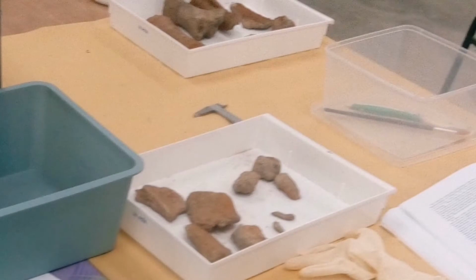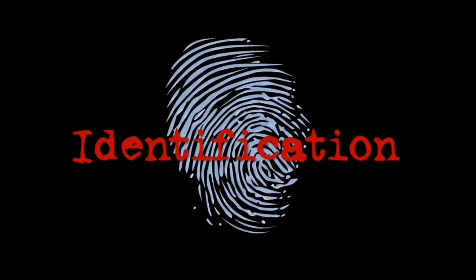This is the second part of bones analysis. It is the continuation of the previous vlog that I've published recently that was focusing on microanalysis. I hope you had watched the first part, and to understand better, the samples that I'll be referring to are those that I've mentioned in the first part. This vlog is about how to identify the bone samples and to distinguish them interspecies.